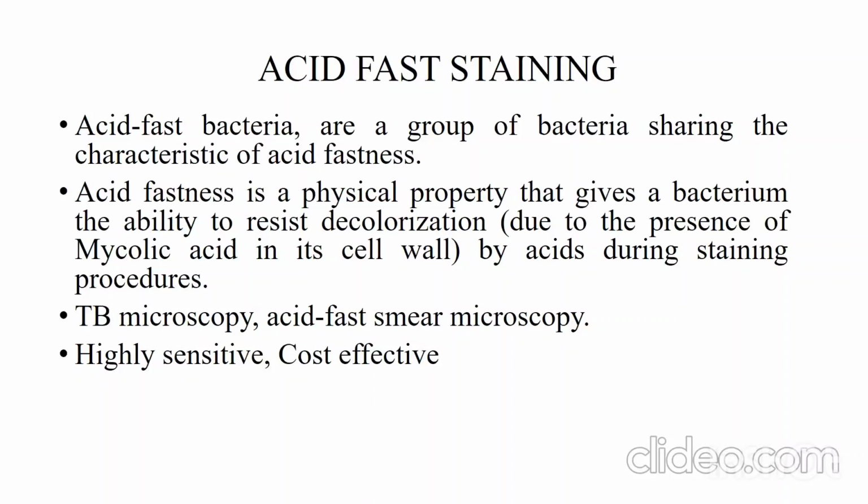Hello everyone. Today we are going to see the acid-fast staining.